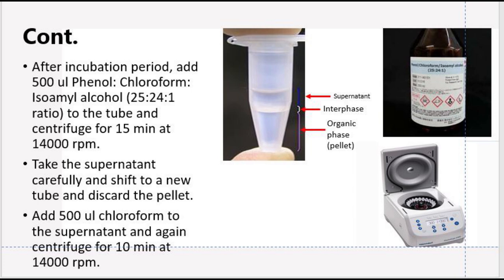After centrifuge, you will have three phases: the uppermost phase is the supernatant, below it is a small very thin layer that is interphase, and at the bottom there is an organic phase. Pick the uppermost phase, the supernatant, very carefully and shift it to a new eppendorf tube.